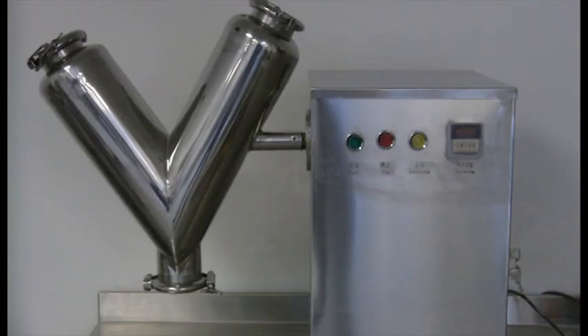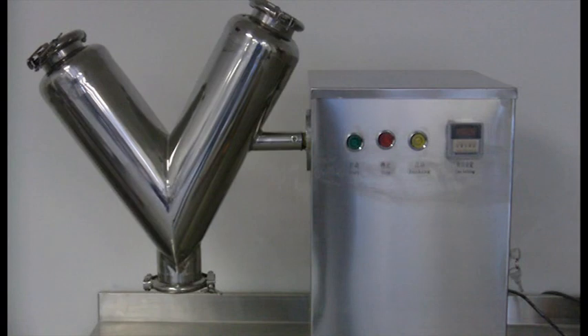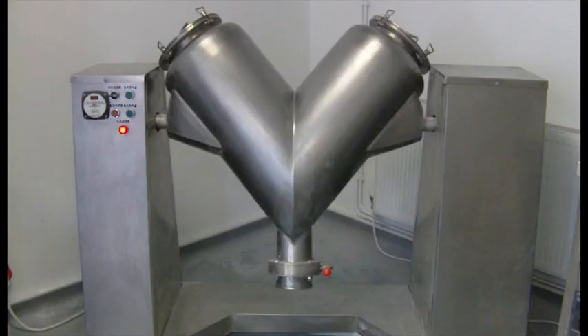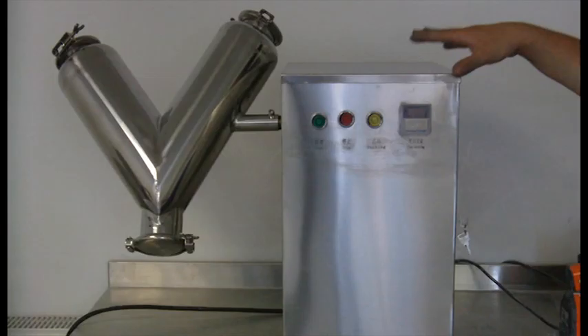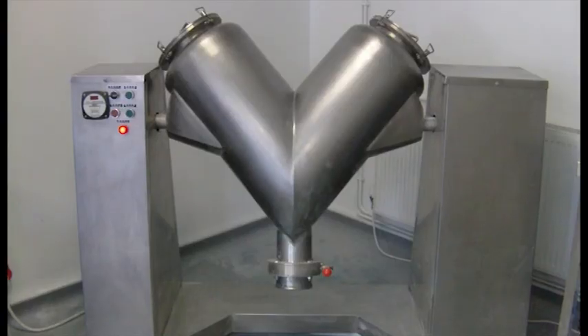Hello and welcome to the LFA introductory video for the VH mixer series. Here we have a VH8 and a VH100. The VH8 has an 8 litre capacity and can hold approximately 2.5 kilos of mix. The VH100 has a 100 litre capacity and depending on molecular density can hold approximately 20 to 30 kilos of product.